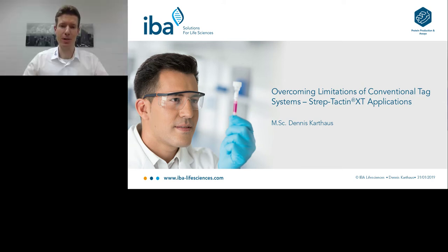Thank you very much for the introduction, and I'd like to thank LabRoots for inviting me to this great conference event. So when you use tag systems, you can use them for two applications. You can use them for the purification of proteins, or you can use them for immobilization of proteins on surfaces like ELISA plates or SPR chips in order to perform assays.